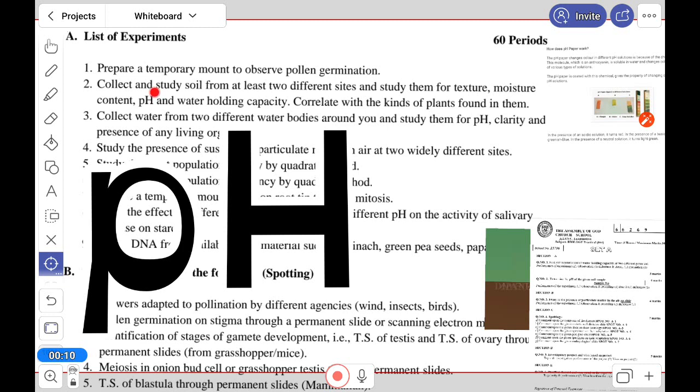You can see that we'll measure the pH of soil and pH of water. We have two given samples, both soil and water. The process will be almost the same for both.